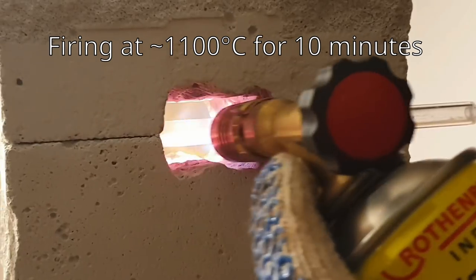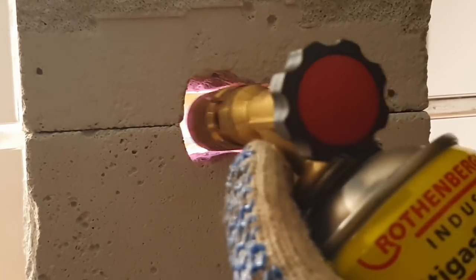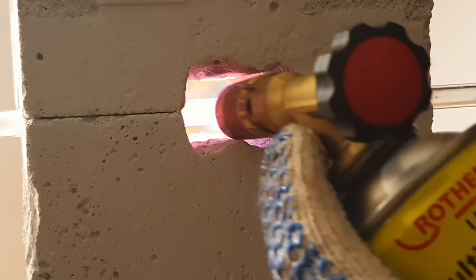Firing is done with the MAP gas torch and lasts around 10 minutes. The material shall glow yellow during the firing.